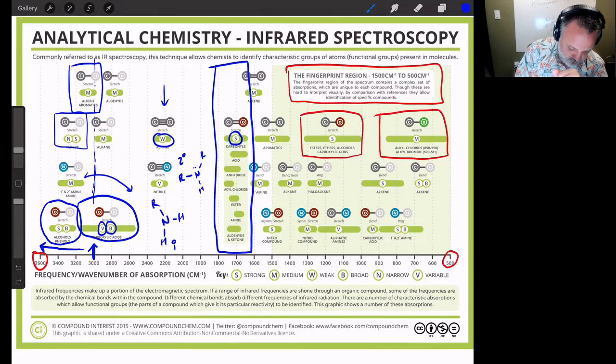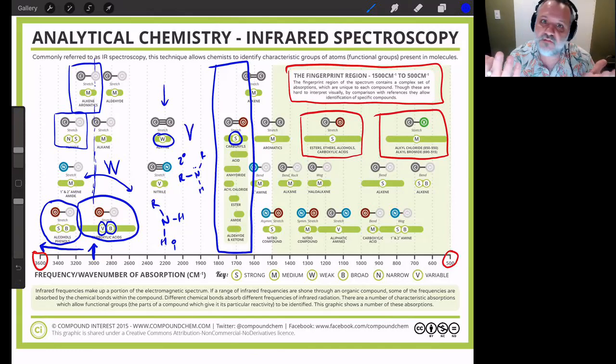For a primary amine, you get two signals. It's sort of like vampire fangs. For a secondary amine, it's like one. It's like a knocked out, it's only one fang. It's Gordo the vampire instead of Dracula, right? His distant second cousin.